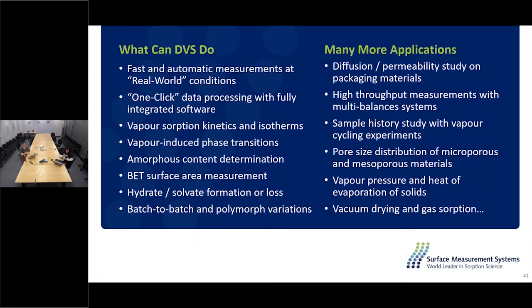And that goes to my last slide, the summary of the DVS technique. It's a very versatile and sensitive technique to determine water sorption or organic vapor sorption with different applications like BET surface area, the formation of hydrates, and batch-to-batch variation as well.